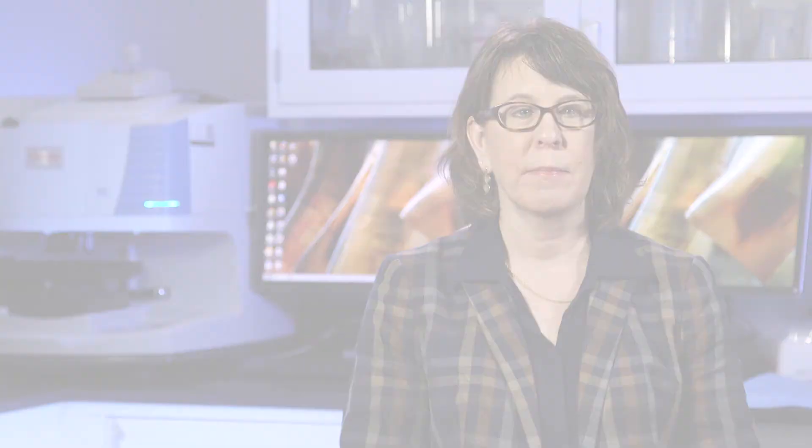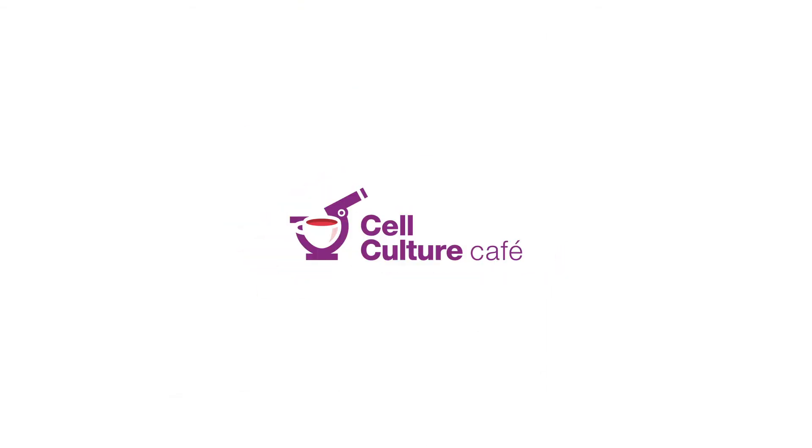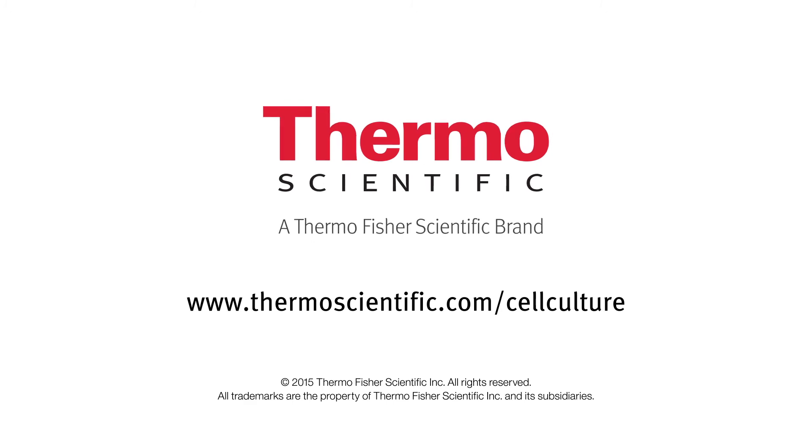If you have an incubator featuring an automated high heat sterilization cycle, you can skip the hazardous chemicals altogether and eliminate the need to separately autoclave parts.